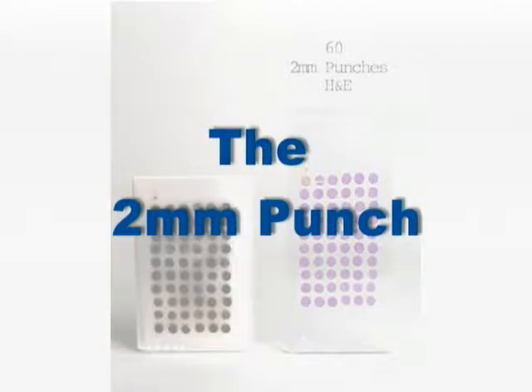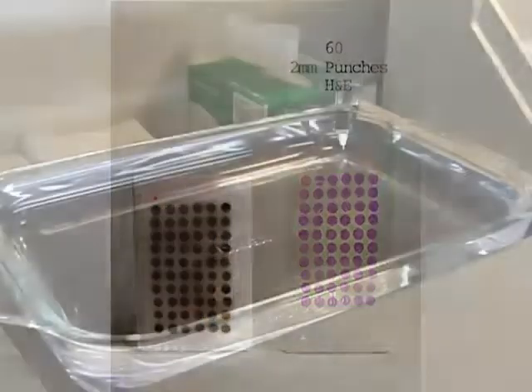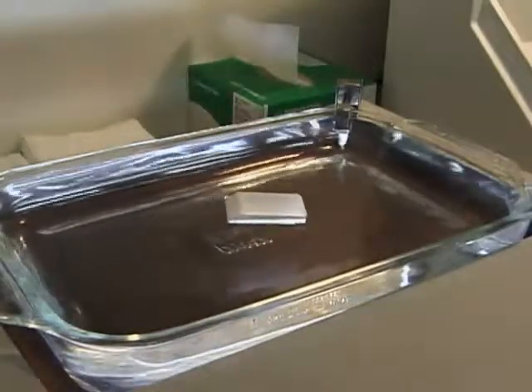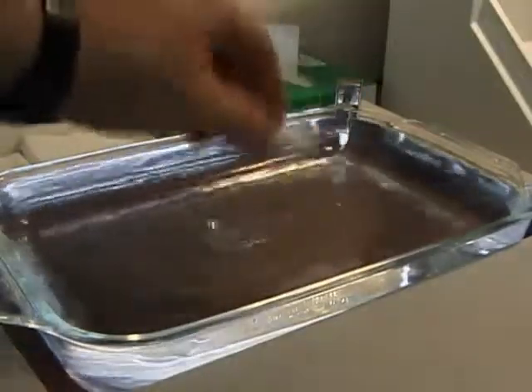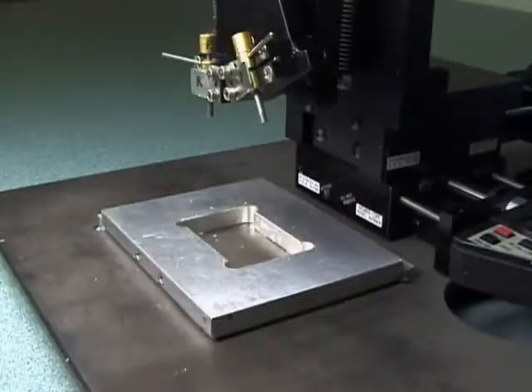If you try to punch the 2 millimeter needle using the same method as the 0.6 millimeter needle, the paraffin will crumble around the punch hole. To eliminate this problem, place the recipient block into a water bath or oven at 37 to 40 degrees Celsius for approximately 10 to 15 minutes. This softens the paraffin so the block can be punched.